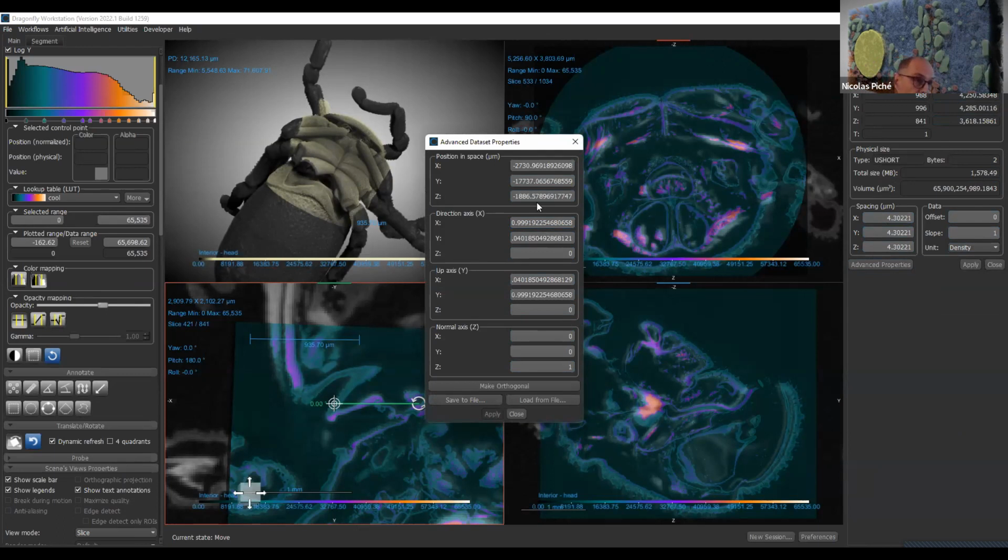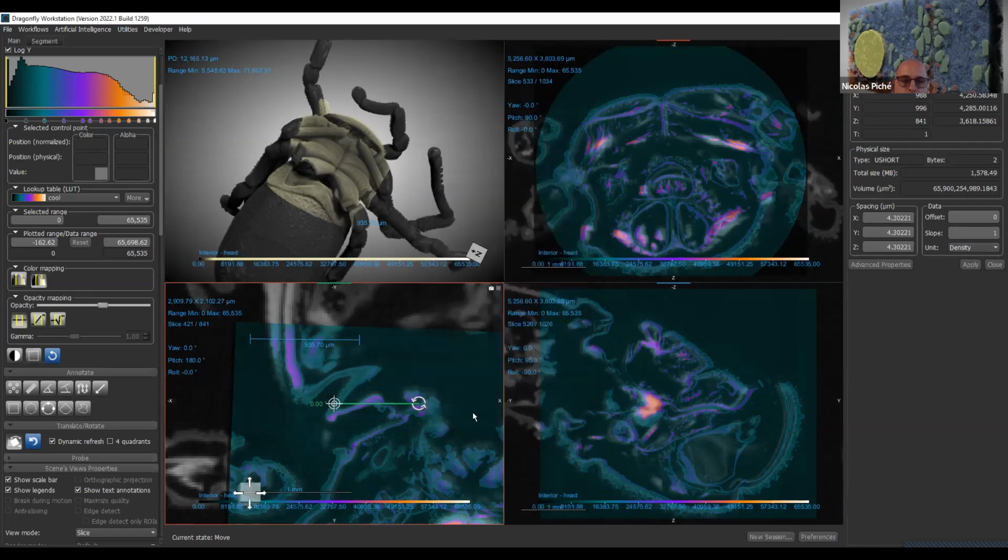There's not a lot of formats that support that. DICOM does, or our own format. TIFF does not support orientation, although it supports spacing properly. So some people hide that information in proprietary formats, like in CZI, they may have included something to code it, but it's not super common. So on other software, you would have problems doing it.